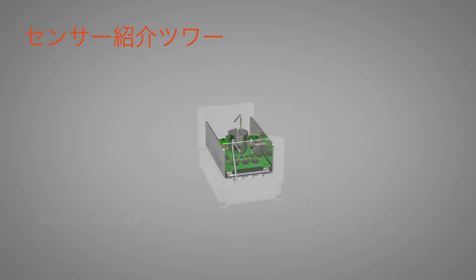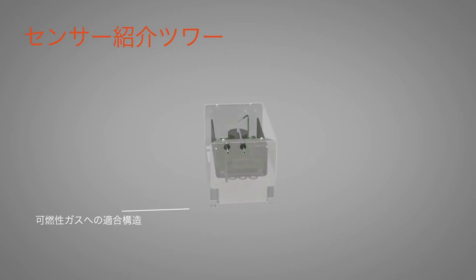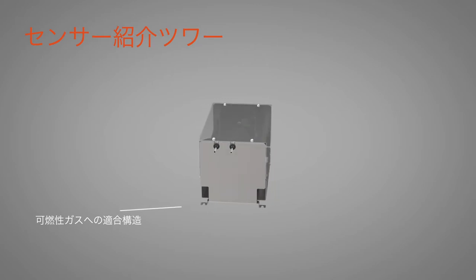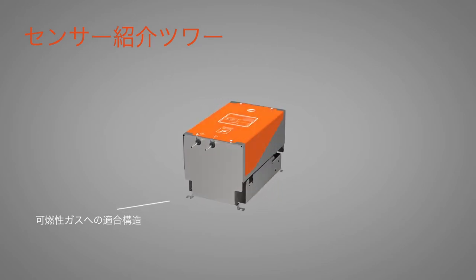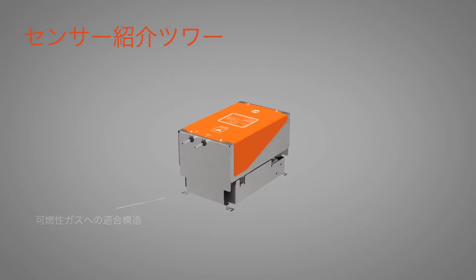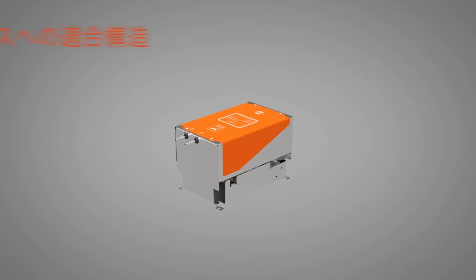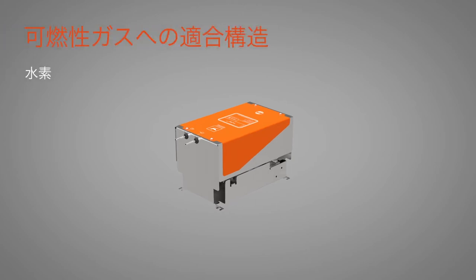It's also constructed to be compatible with flammable samples. Gases measured include Hydrogen, Helium, Argon, and Nitrogen.